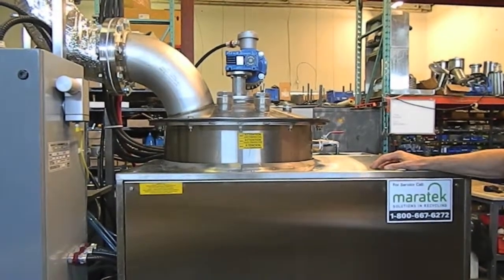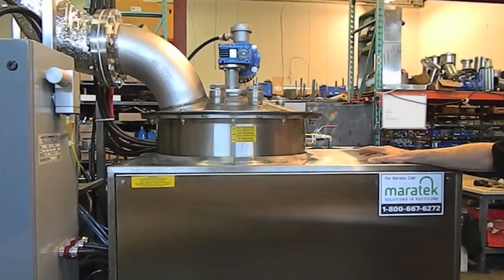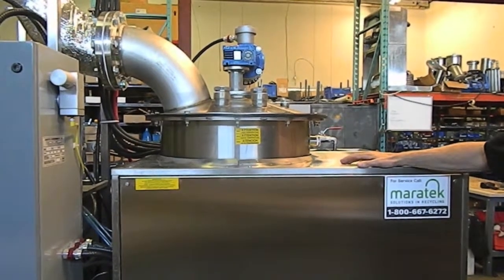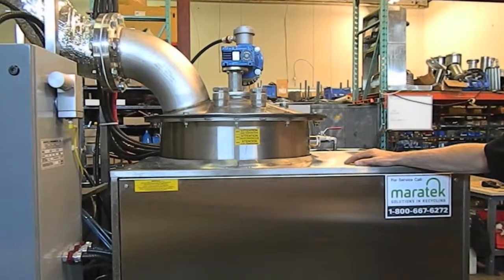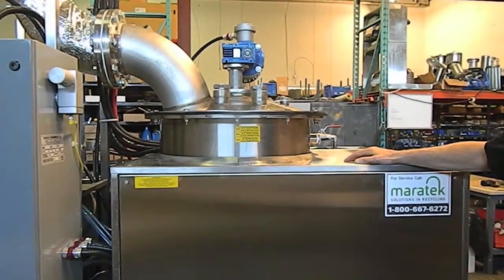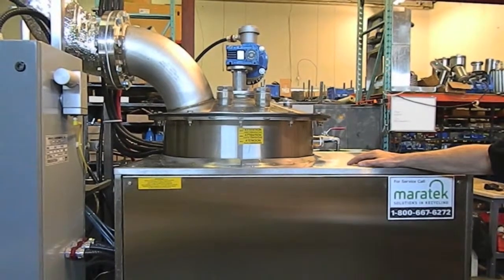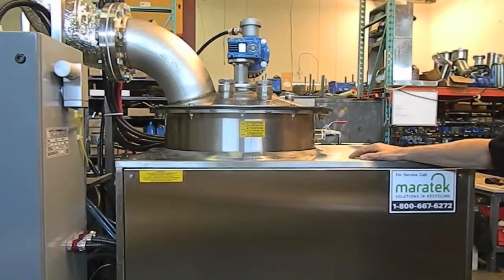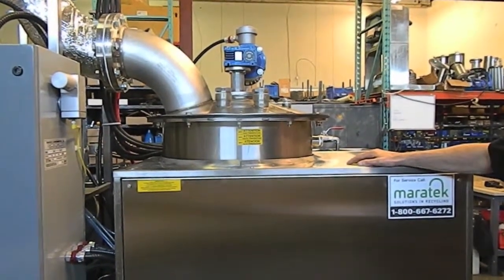Heating in the system is done electrically — it's got three big electric heaters that heat up an oil jacket which provides the heat for distillation. It can also be fitted with steam heating for larger applications, so depending on your choice you can go electric or steam. The cooling is air cooled in this case but can also be water cooled as an option, so you have your choices when we work through the design with you.